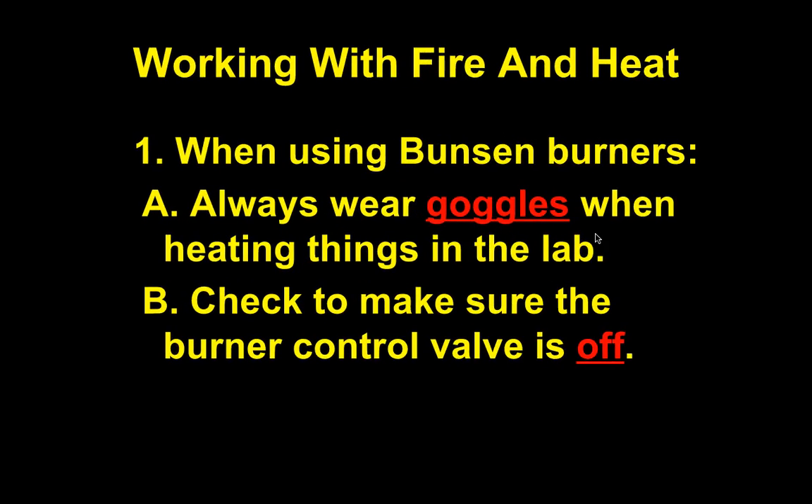Working with fire and heat: you will work with flames this year and with some hot liquids. When using Bunsen burners, we'll review this now and again the first time we actually use them. Always wear goggles when heating things in a lab. Sometimes it's just goggles for Bunsen burners; other times with hot liquids you'll need goggles and an apron.